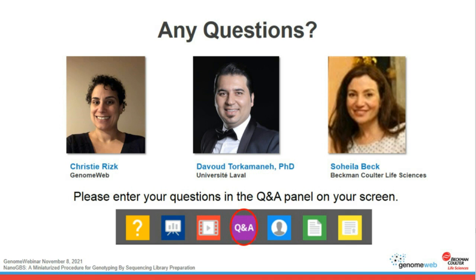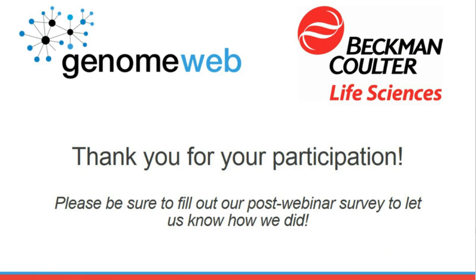Davoud, our first question: could you tell us if you saw any inherent advantages of using Ion Torrent compared to Illumina or other sequencers in your lab? Thank you. That's an interesting question because we had the Ion Torrent machine in the lab. We mostly use Ion Torrent, and the reason why we were using Ion Proton with the Ion Torrent technology was that during genomic selection work, the timing is really important for us, and sometimes we need to sequence every sample that we receive quickly.